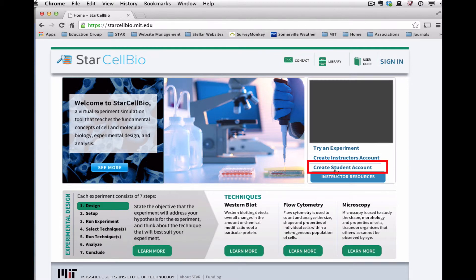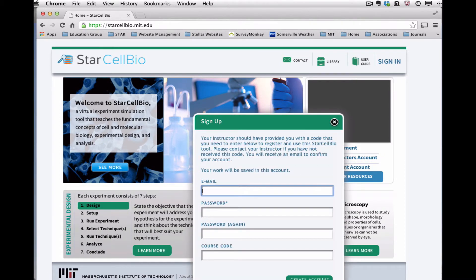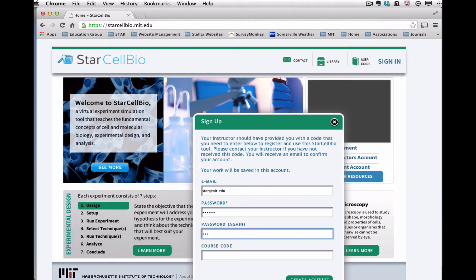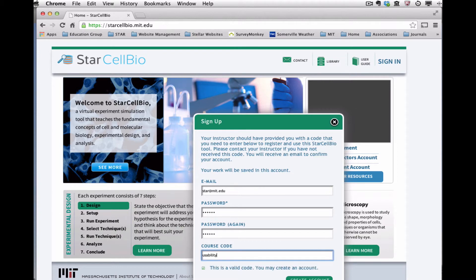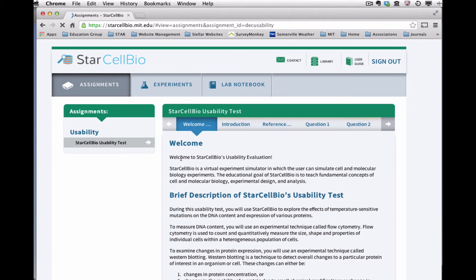To do this, click on Create Student Account on the right side of the homepage. Enter your email address and password for your new student account, along with the course code that your course instructor has provided to you. Then click Create Account. Your student account will be set up and you will be automatically signed into your account in StarCellBio.